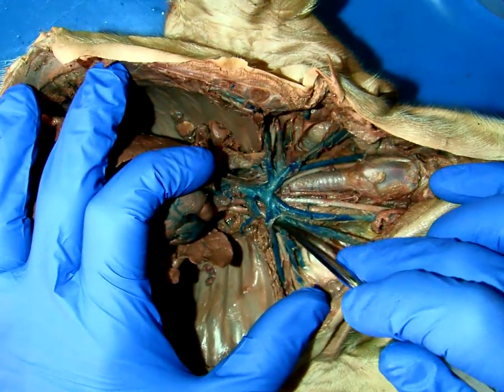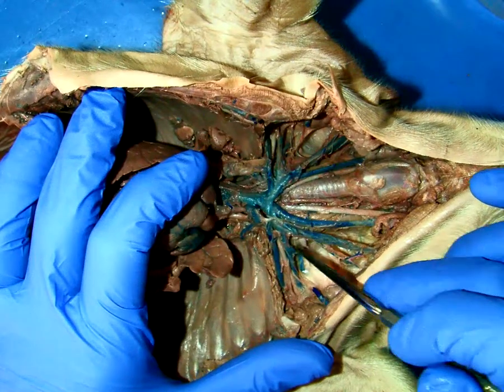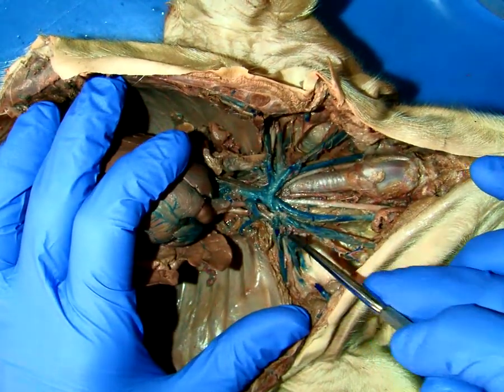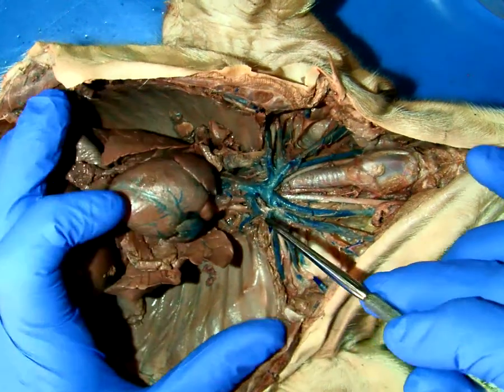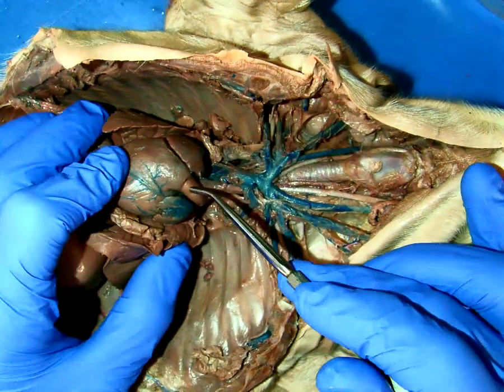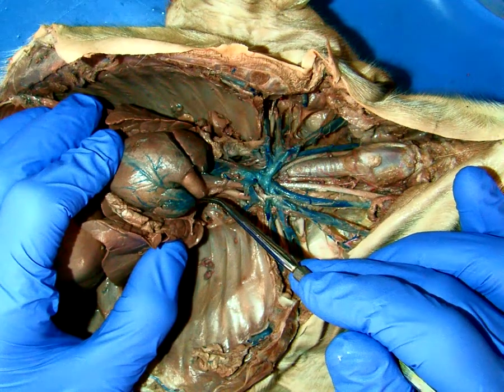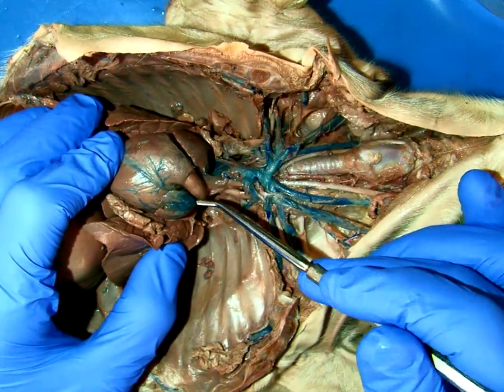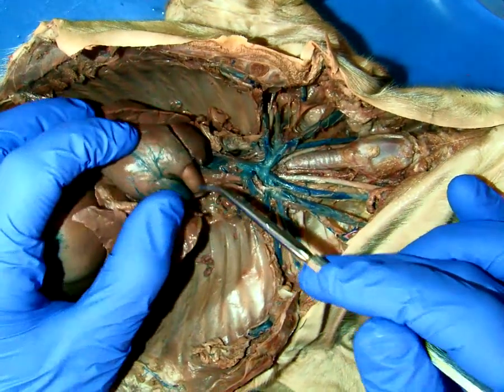subclavians, and especially in this. I mean, the jugulars and the carotids are pretty straightforward, but tracing from branches, I'm going to use that as my basis of discovery. And so if I look at the arterial tree, taking blood away from the heart, of course the most prominent vessel is the pulmonary artery, which is always the most anterior or ventral vessel in a pig, leaving from the right ventricle.